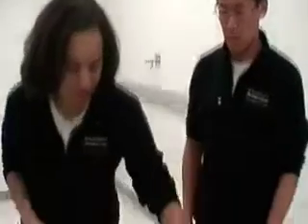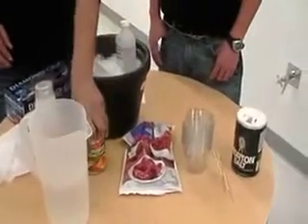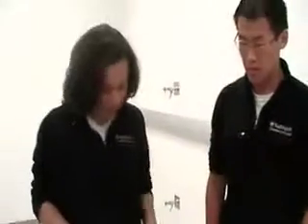Okay, so the first thing you want to do whenever you're starting a science experiment is to make sure that you have every single thing that you need. In this experiment, the students are going to isolate DNA from fruit like strawberries or peaches. So let's make sure that we have everything we need.